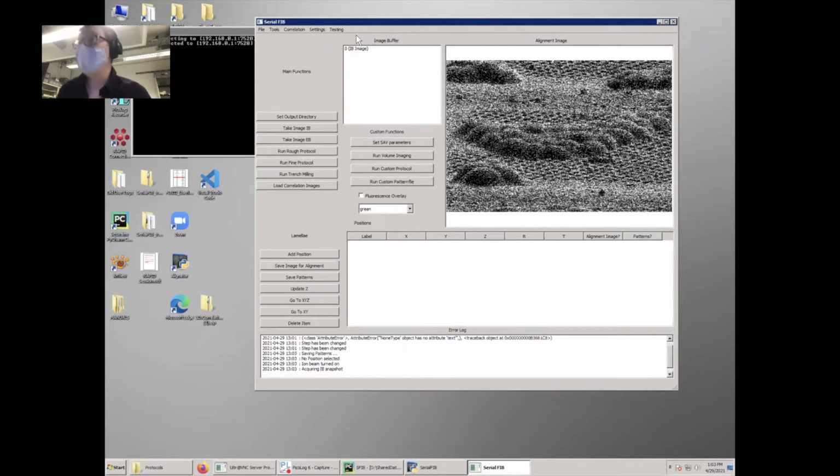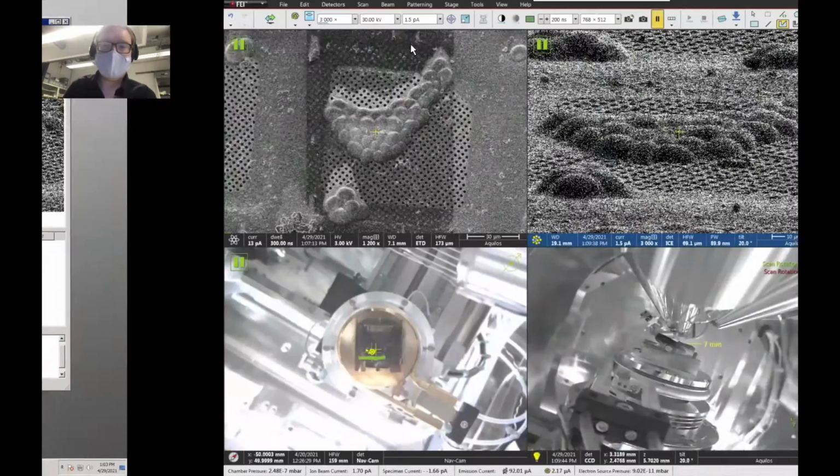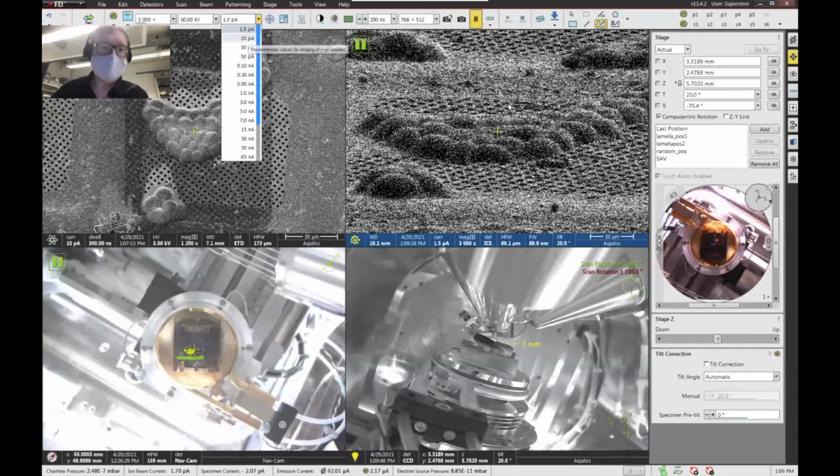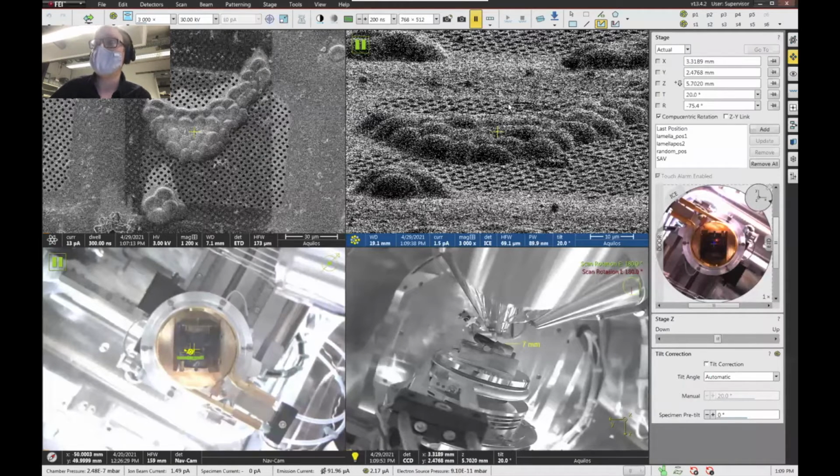And then what's going to happen is, since I can show you that, we've been waiting quite some time for the aperture to be replaced. And actually, if I go to the 10 picoamps, which would be the standard here, and you check here in the bottom how much 10 picoamps actually translate to with our old apertures at the moment, it's 100 picoamps. And that's obviously not good because you're going to expose your sample a lot.